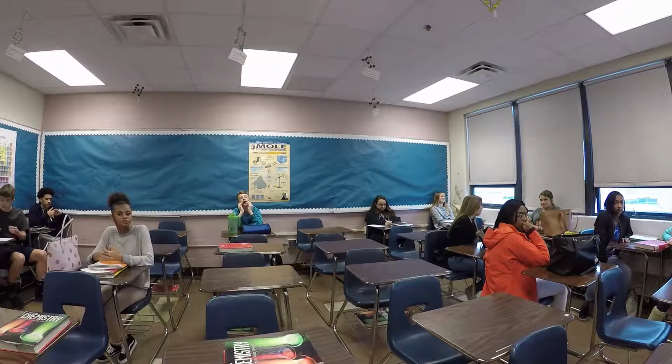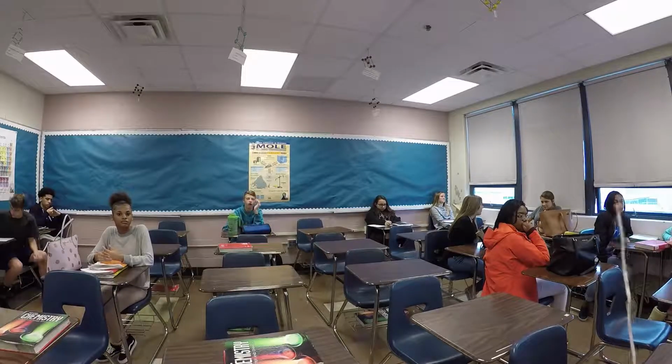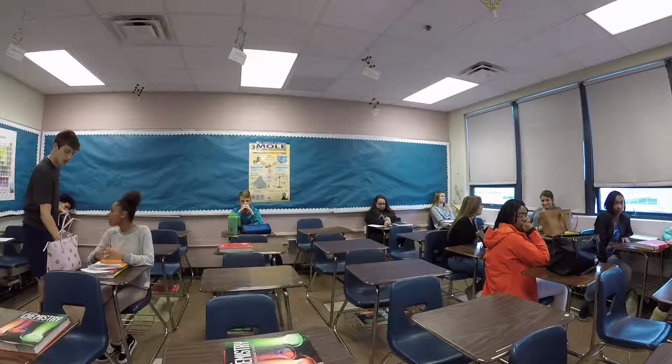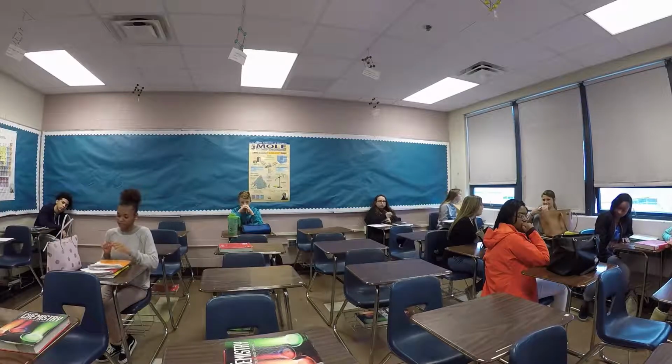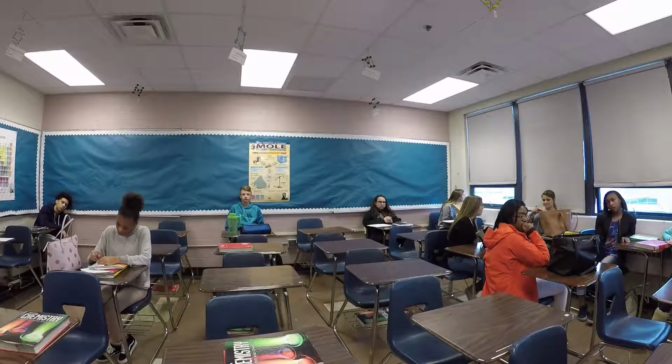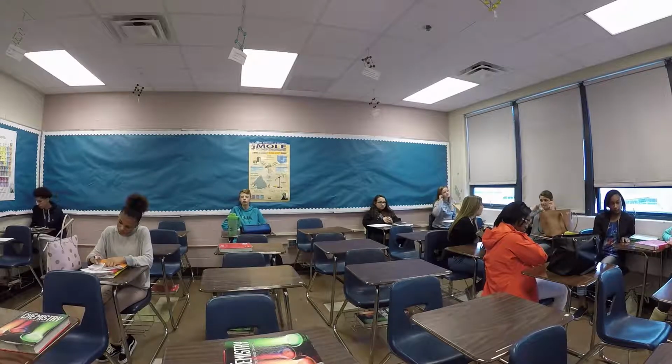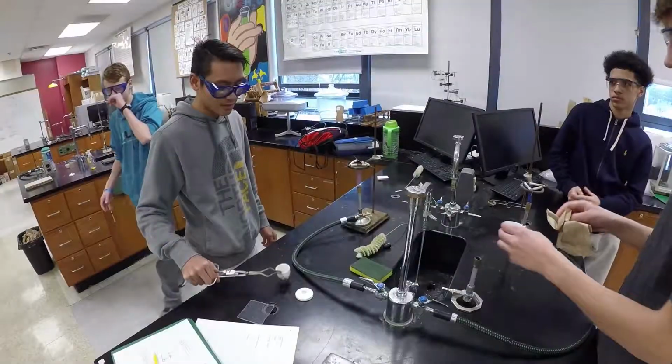So if you drop the crucible on the floor or on the table, then you will not be making more. But today in the lab, we want you to see if you can make more mass from the air. You're going to be pulling mass out of the air and sticking it to this metal in the ash. It's pretty cool.